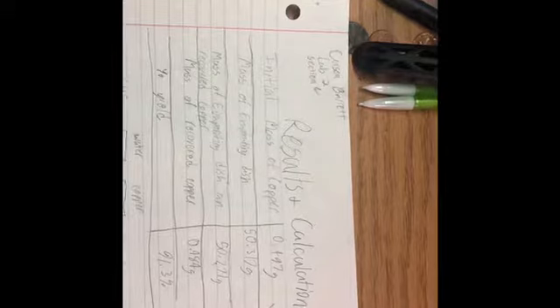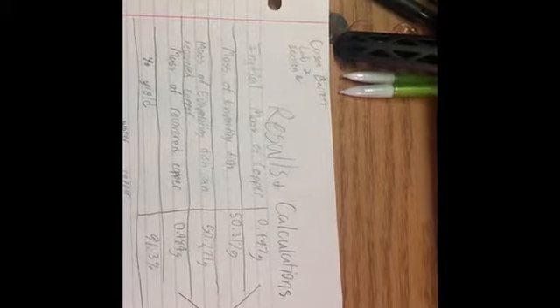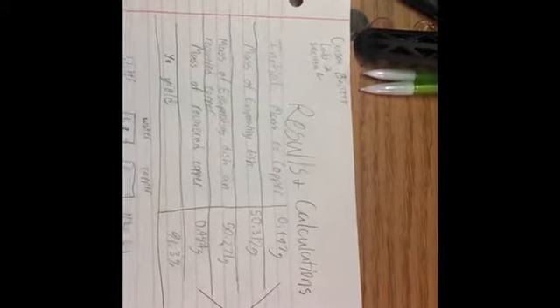And the percent yield was 91.3%, which was found by dividing the mass of the recovered copper by the mass of the initial copper, and that came out to 0.913 times 100 is 91.3%.